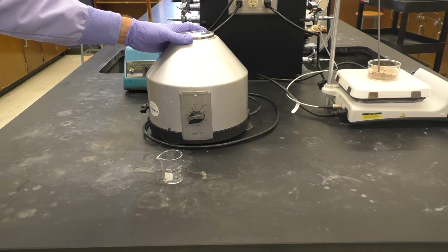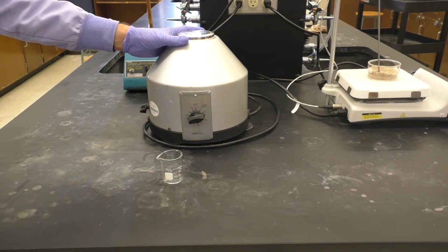And in this process, through the force that the centrifuge exerts on the sample, it will drive the solvent out of the little bit of space that's there, but the plunger will keep the solid material left behind. So we should be able to remove the solvent in this way.